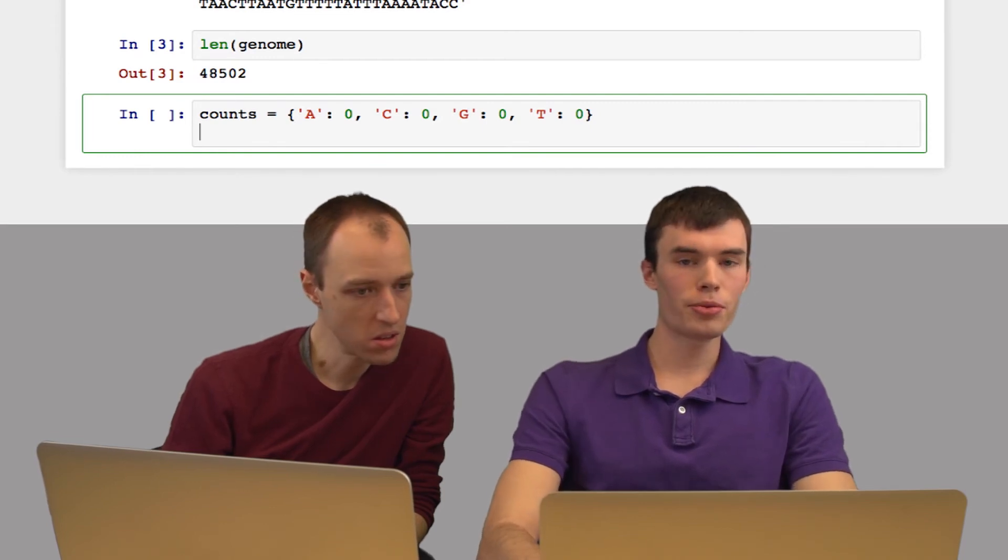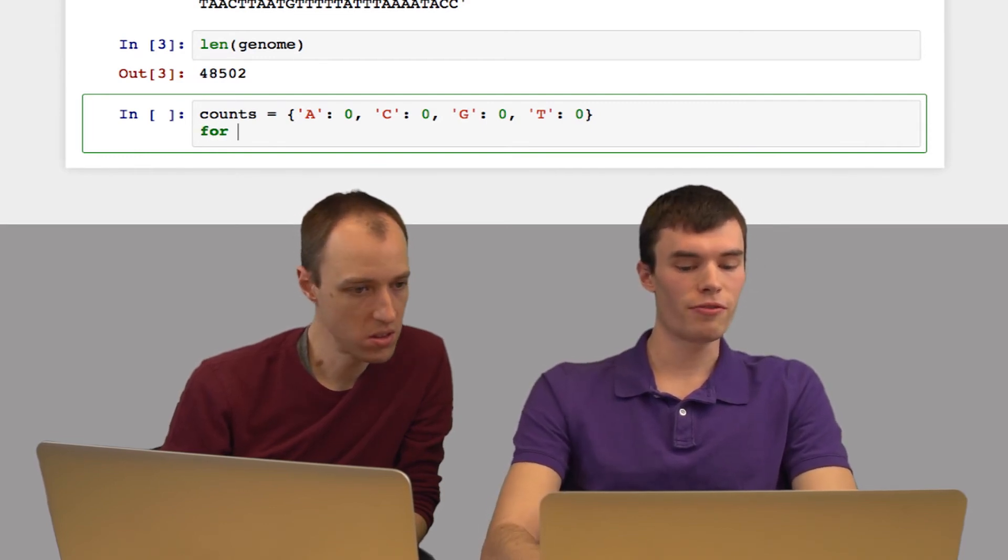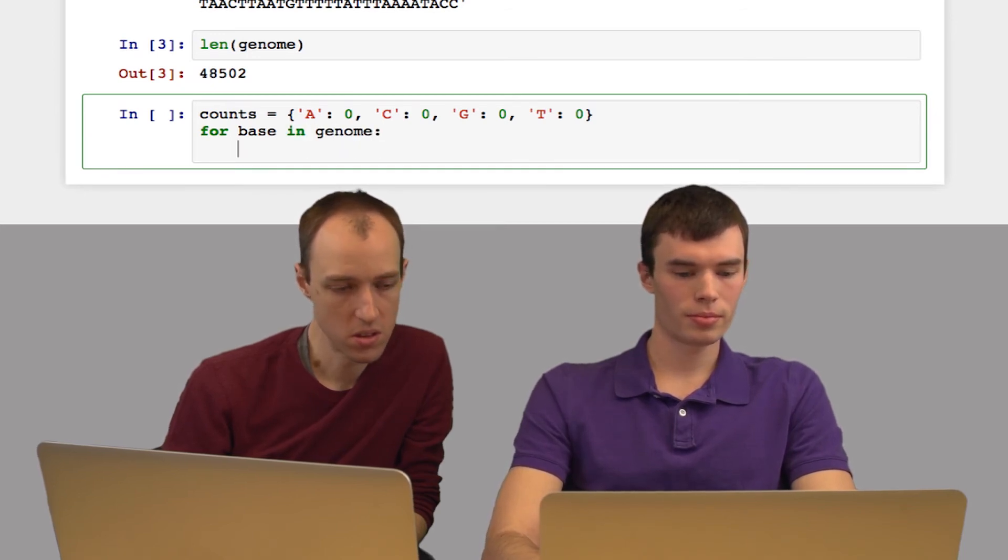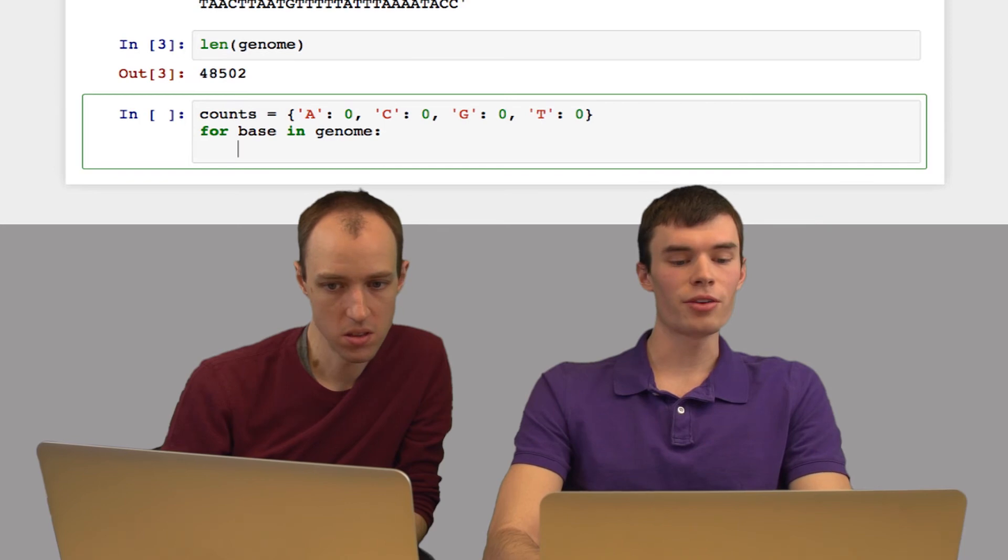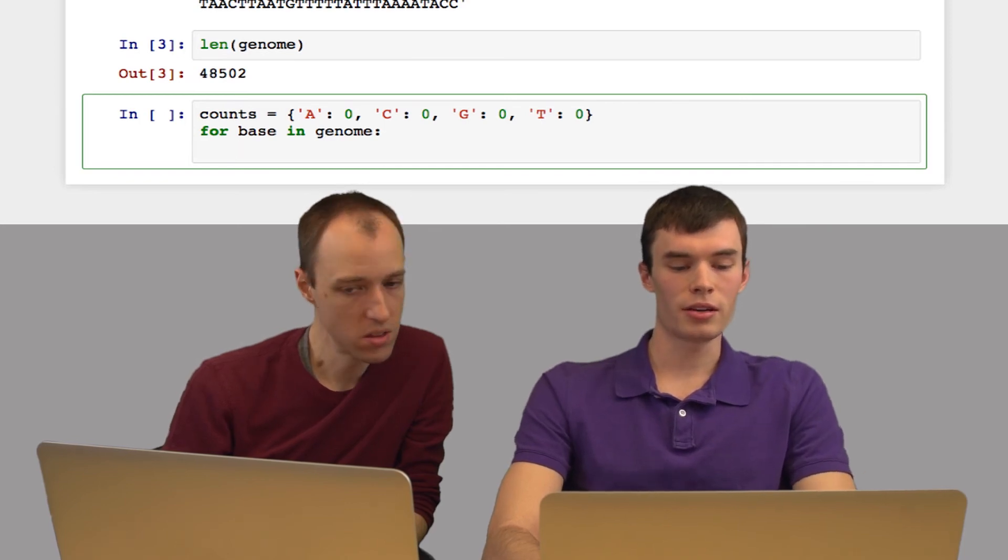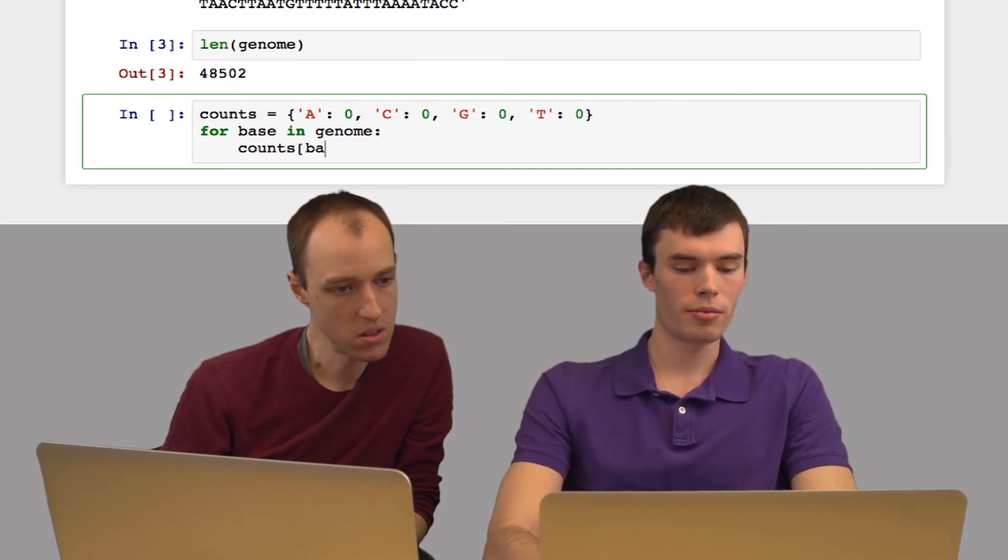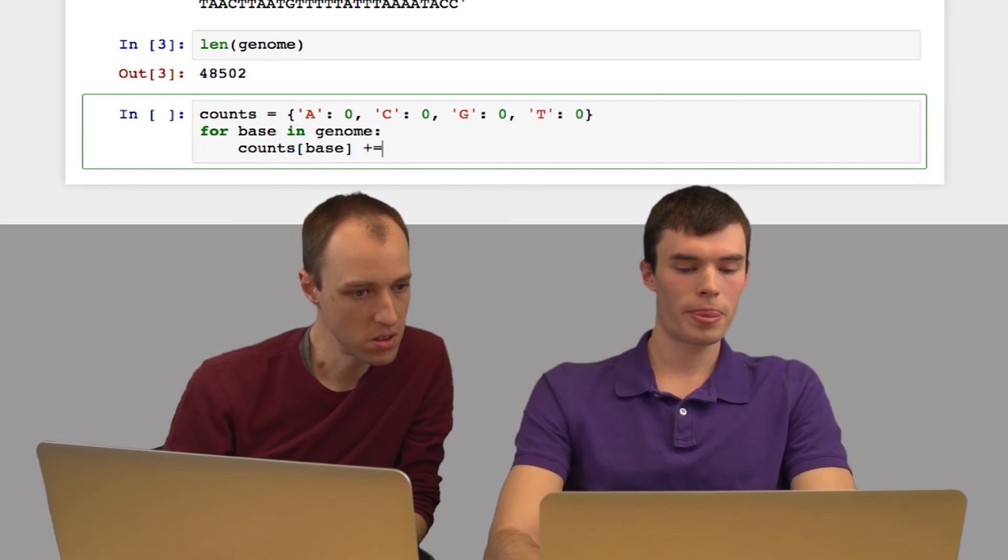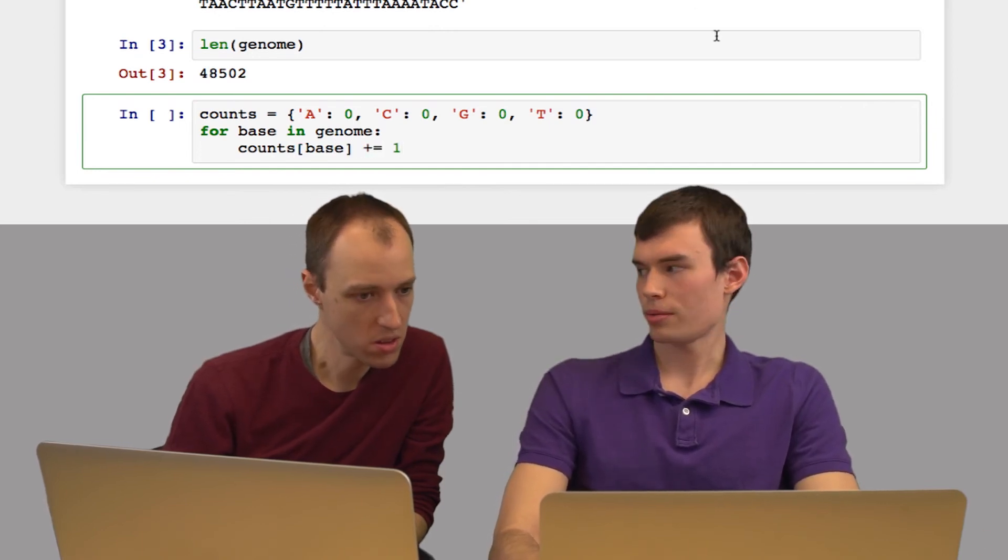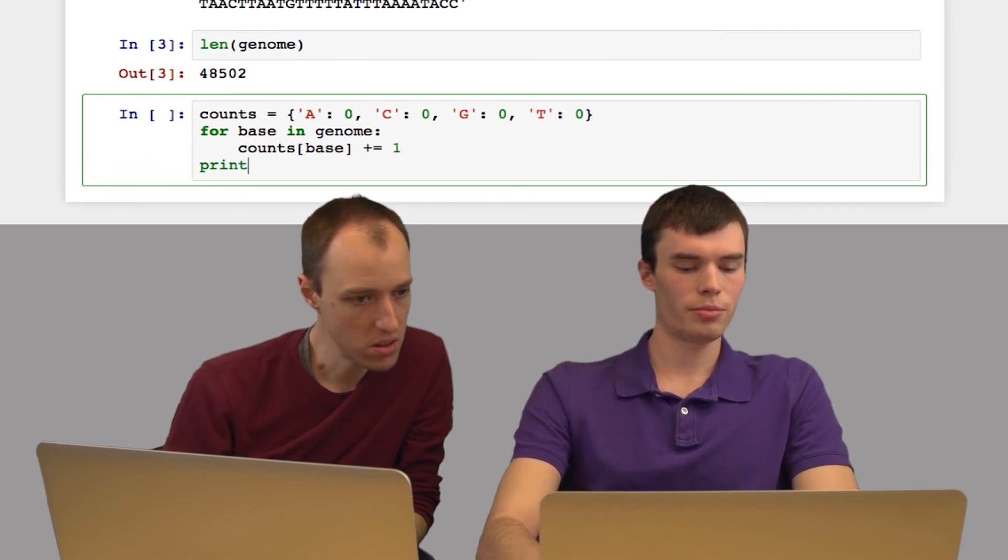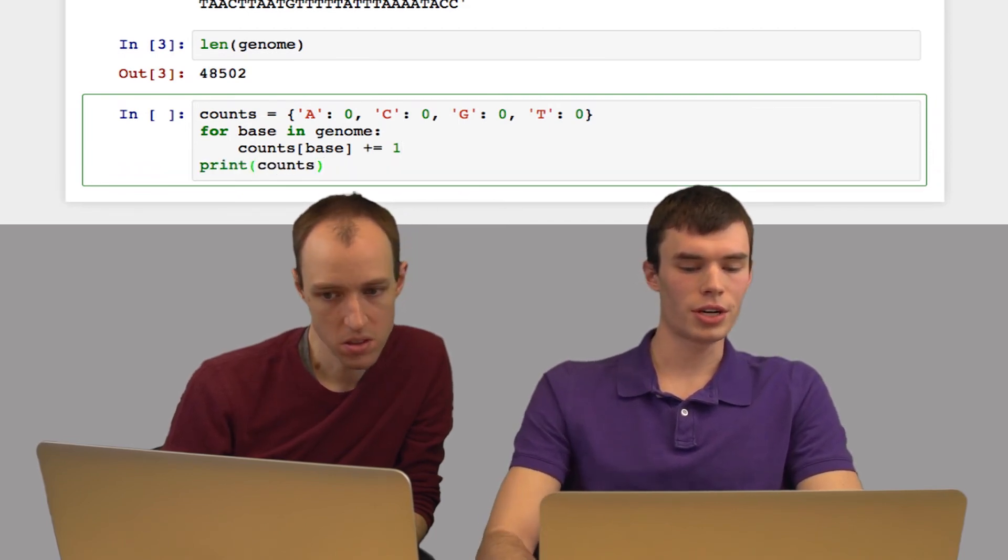Now I'm going to loop through each base in the genome. So I'm going to say for base in genome. And I'm going to increment the value at that key in our counts dictionary. So I'm going to say counts[base] plus equals one. Just like that. And then when that's done, I'll just print out our counts dictionary.